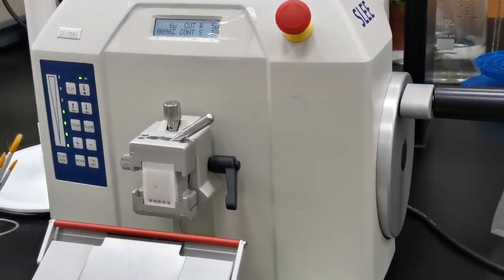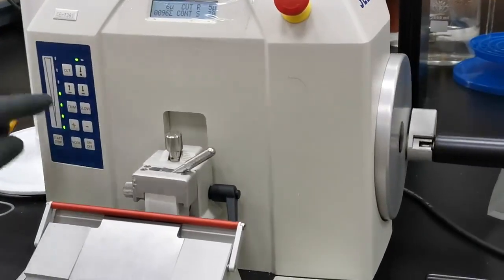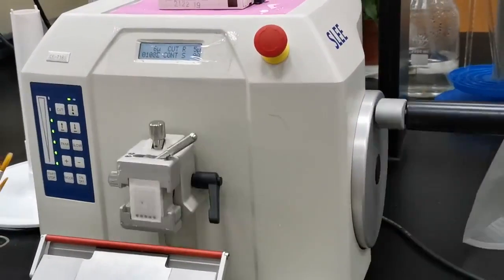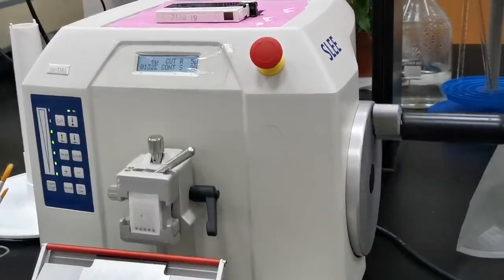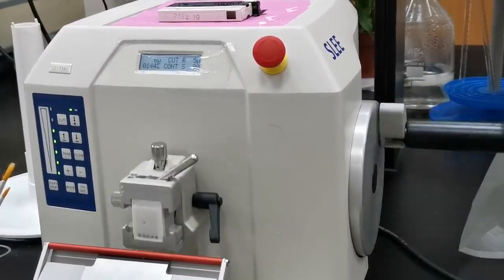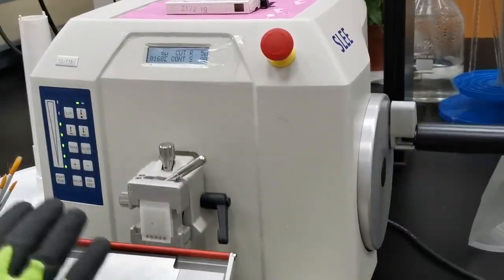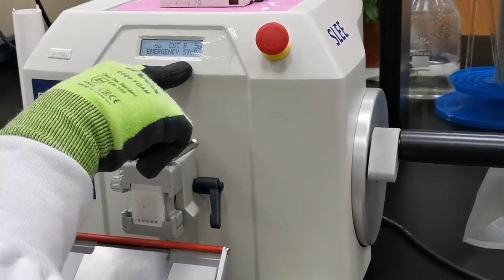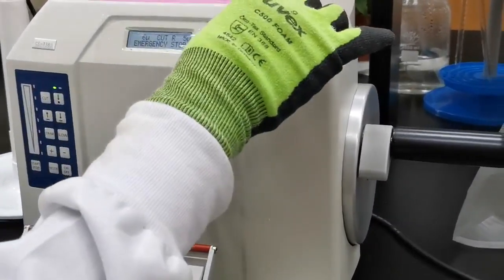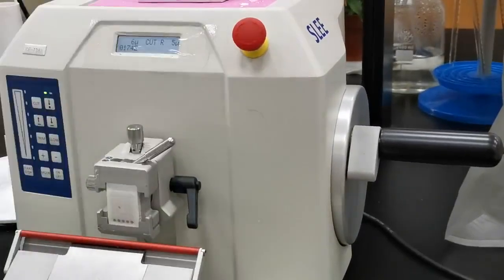While you are working, if something goes wrong, you have the safety emergency stop — this red button here. If you want to stop the machine suddenly, press this button and it will emergency stop. To release it back, just turn it, and it will be released.